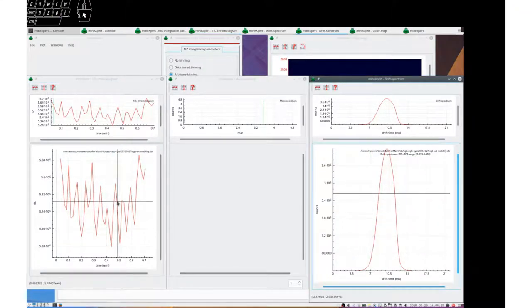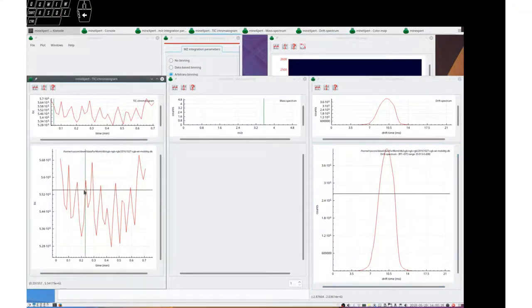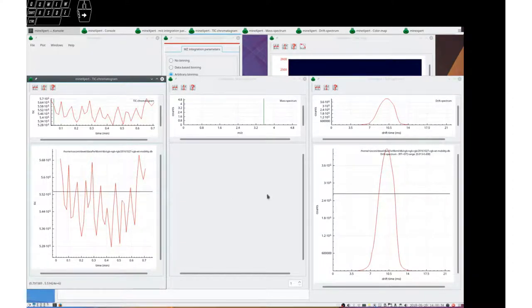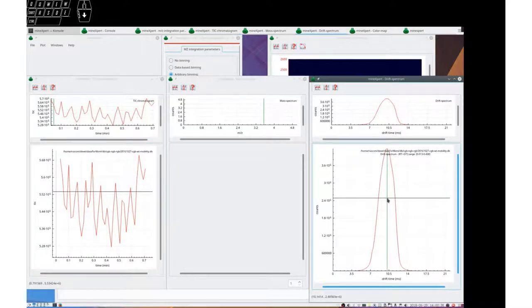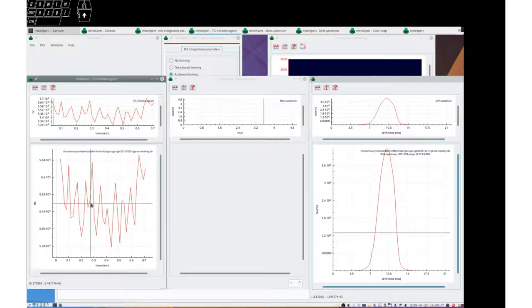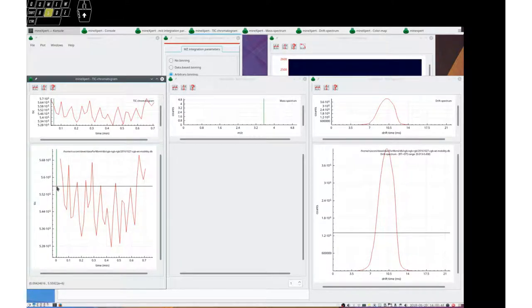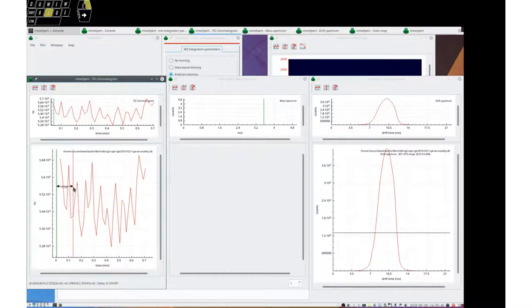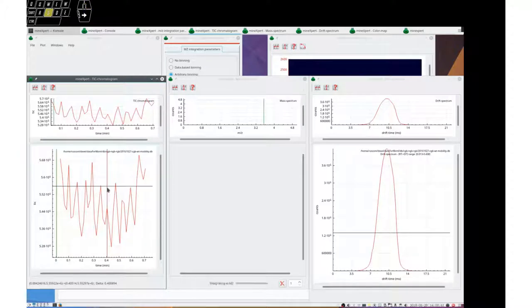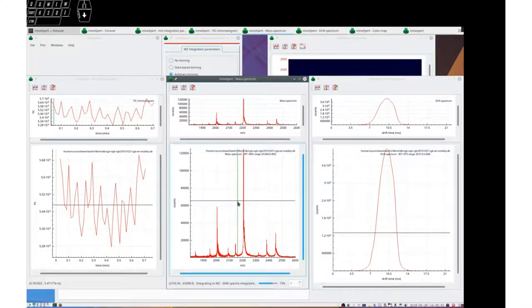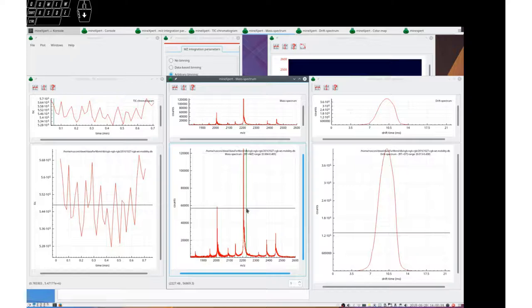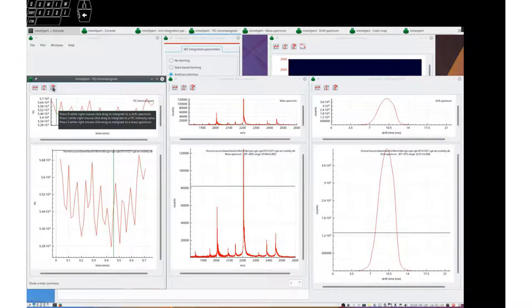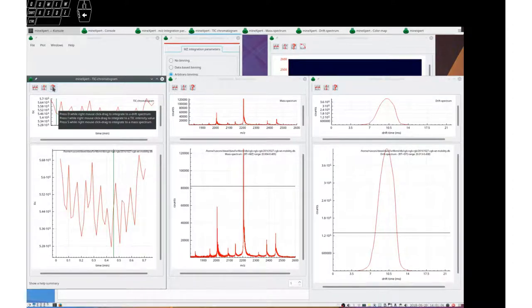We had pressed the D keyboard key to ask for a drift spectrum. If we want a mass spectrum, we would first press the S key, right click, drag the mouse over the region of interest, release the mouse button, and the integration would be performed. This is what is said here: Press S while right mouse click drag to integrate to a mass spectrum.